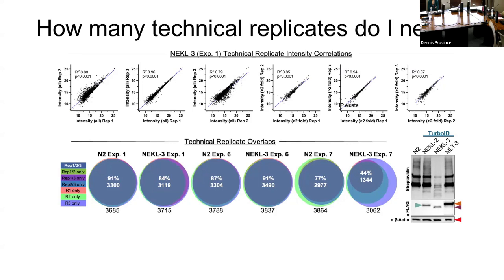I mean, the N2 isn't as good as these, but it's not bad. This one clearly, like, there was something wrong big time with one sample, and that other sample wasn't great either. And here's the gel, right? This is replicate 2. That looks okay. Well, there's obviously something we screwed up there. Why did we send you the samples? I have no idea, right? We shouldn't have, right? So that was a little bit of a waste. So that was on us.